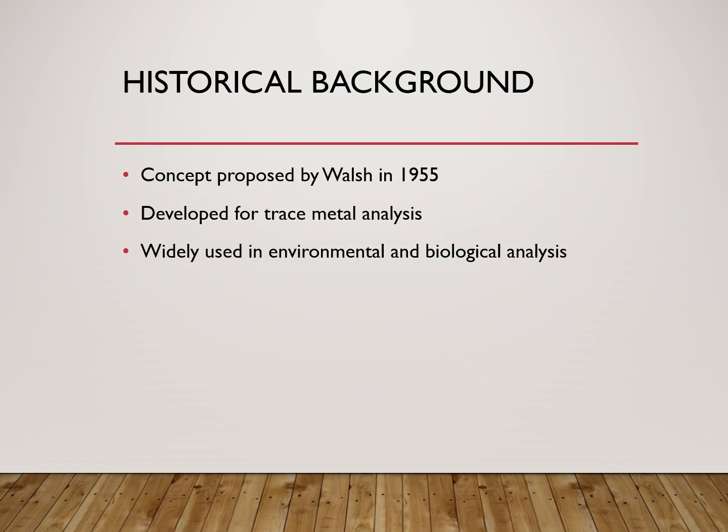The theoretical basis of atomic absorption was known earlier, but Alan Walsh in 1955 successfully developed atomic absorption spectroscopy as an analytical technique. Since then, AAS has become a routine laboratory method for metal analysis.